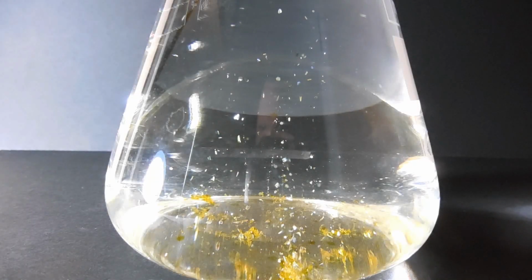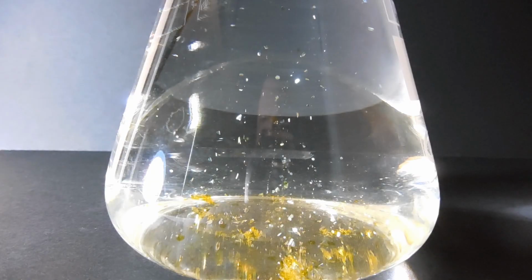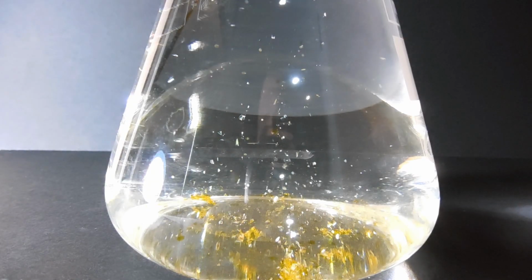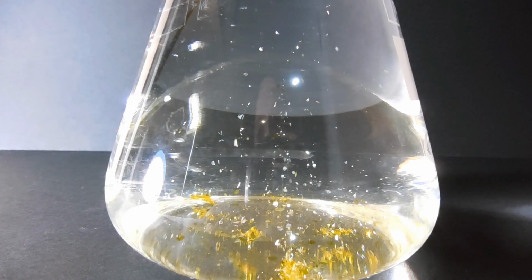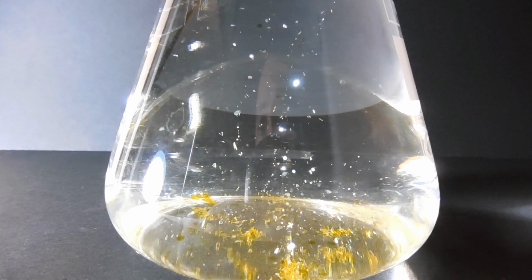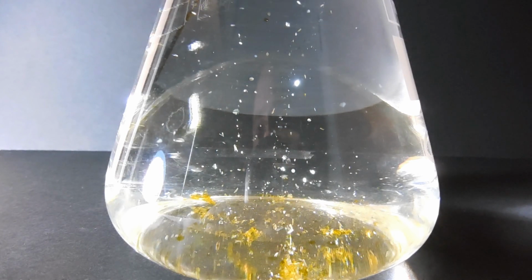After taking quite a long time to cool down, we're finally starting to see some precipitation, and now we can see why this demo is called the Golden Rain. We get these just gorgeous hexagonal plates of the lead iodide that start to crystallize as the solution cools down.